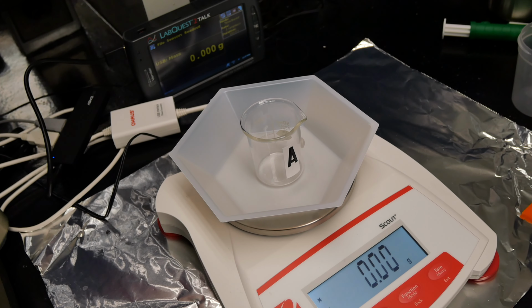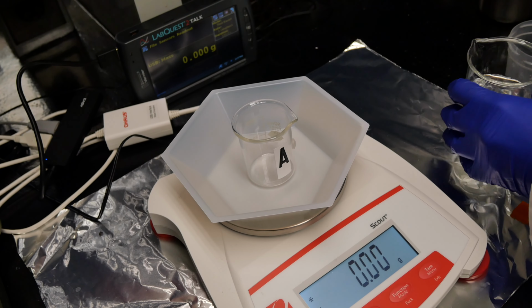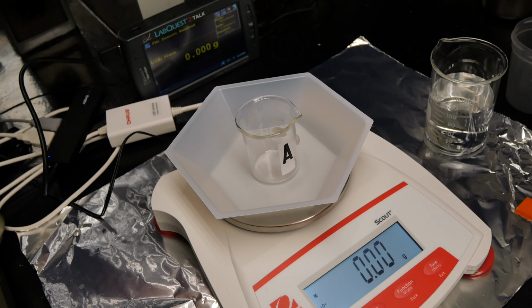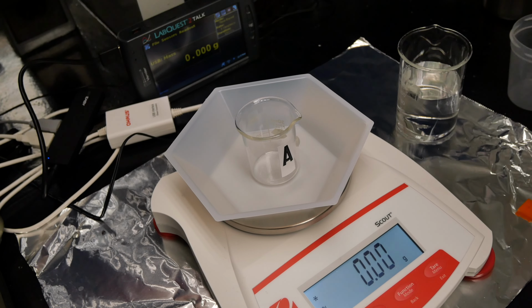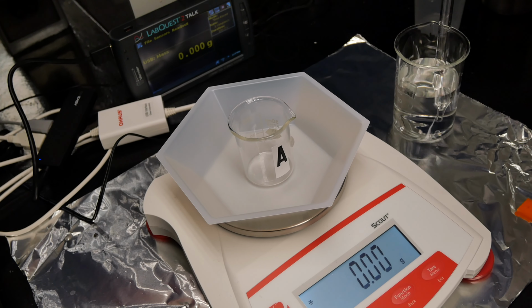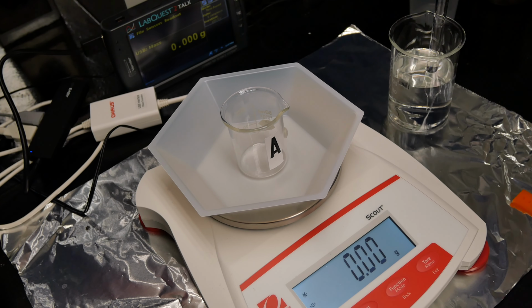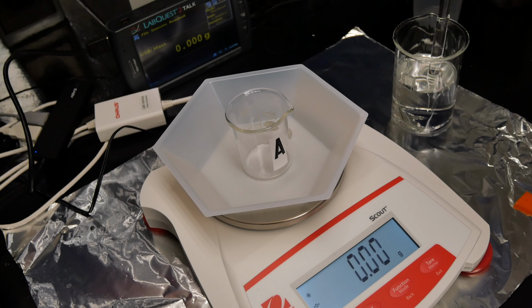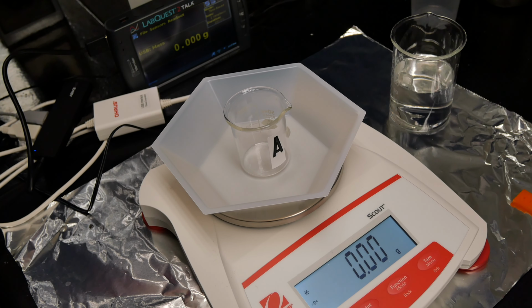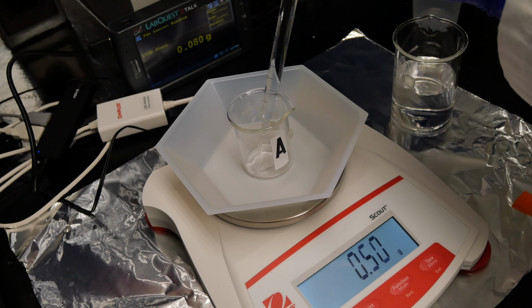Mass 34.480. I tare the balance. Mass 0.000. I fill up a pipette with water. I dispense a little bit of water.